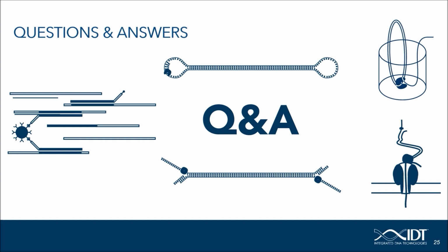Thank you very much for your question. Yes, indeed, we did require some optimization. The first level of optimization was done by IDT, as we specifically asked for a panel that is meant to do long fragment capture.